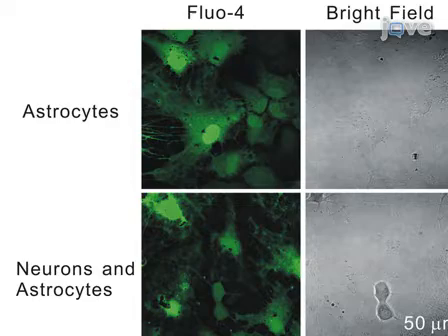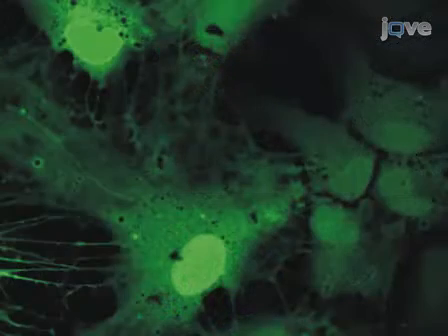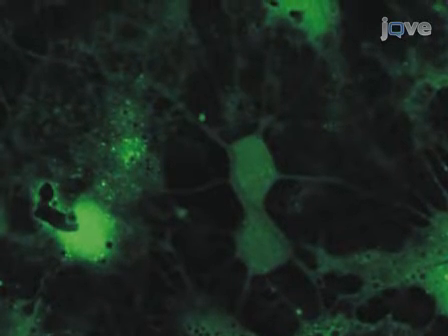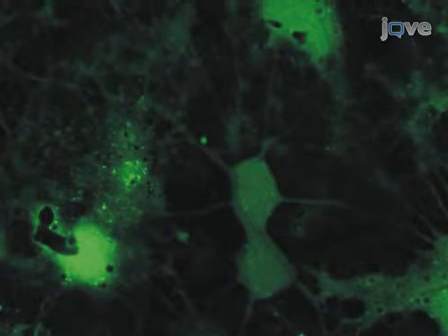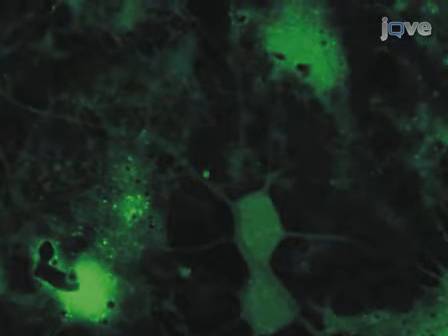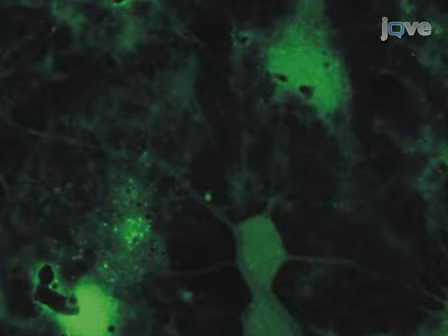These images show Fluo-4 loaded astrocytes and neurons. Astrocytes are flat cells with fine processes, whereas neurons have round cell bodies and thick and long dendrites. Both astrocytes and neurons look healthy and loaded with Fluo-4 properly. Looking at astrocytes by epi or confocal microscopy is useful to confirm healthy cells and proper dye loading. In the regions of the astrocyte closest to the cover glass — regions called the footprint — ATP is observed to cause a calcium increase near the plasma membrane. Hippocampal astrocytes are known to express purinergic receptors, and ATP, when applied to the bath, can cause a global calcium release.